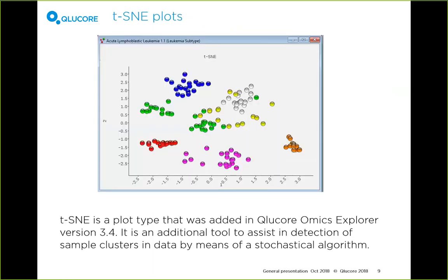So now to today's real agenda, the stuff that we're going to take a look at. The first thing that I'll show during the demonstration part today is something called t-SNE plots. T-distributed stochastical neighbor enrichment, I think it is. Let me check that. Let me see. t-SNE stands for T-distributed stochastical neighbor embedding.